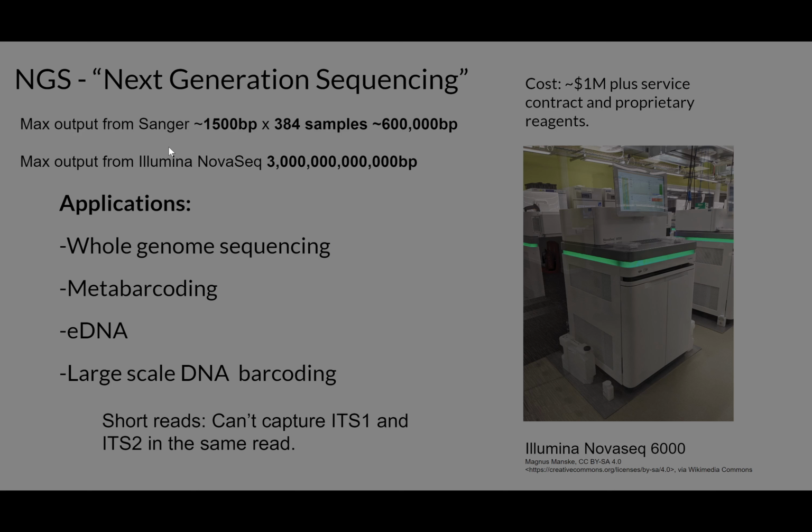So pretty awesome. The applications for this technology are beyond DNA barcoding, and you generate so much data that you're really using this for either whole genome sequencing, meta barcoding, eDNA sequencing, or very large-scale DNA barcoding when you want to generate millions and millions and millions of sequences.